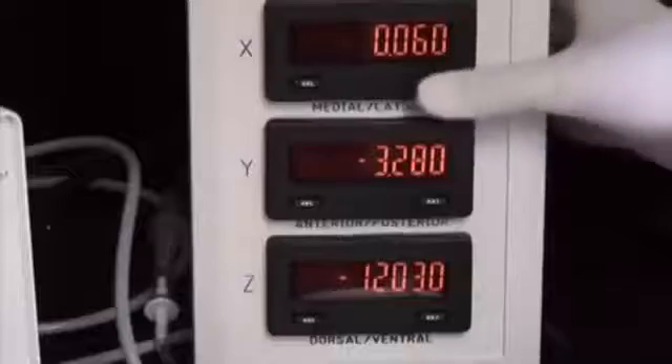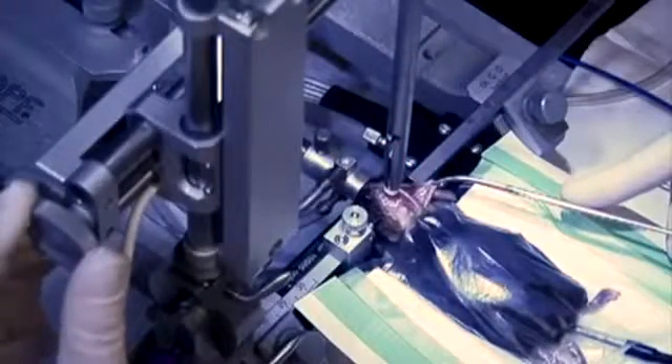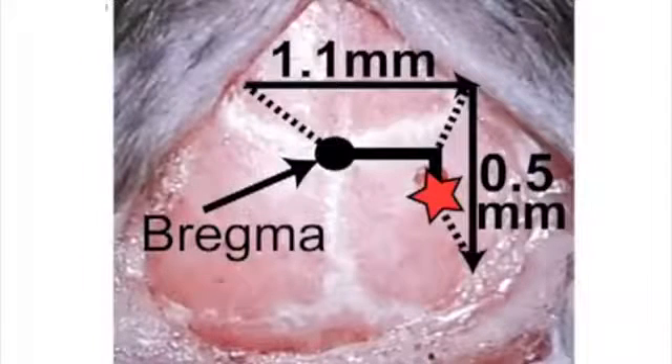Working quickly, touch the catheter tip to bregma and zero the coordinates on the digital display. While holding the skin out of the way with the curved hemostat, raise the catheter and move it 1.1 millimeters laterally to the right and 0.5 millimeters in the posterior direction, as indicated on this diagram.